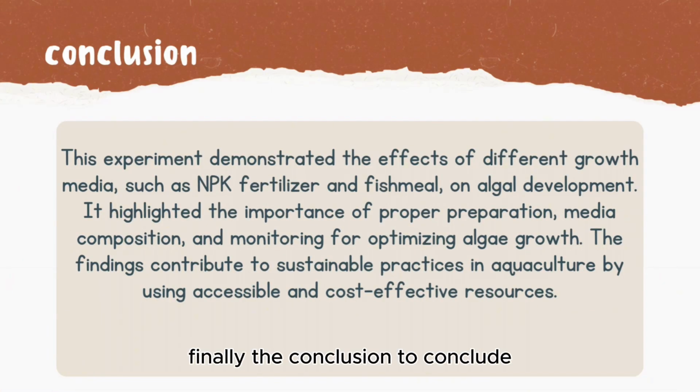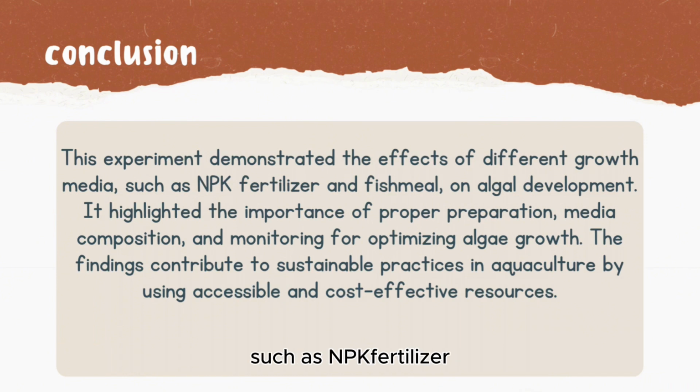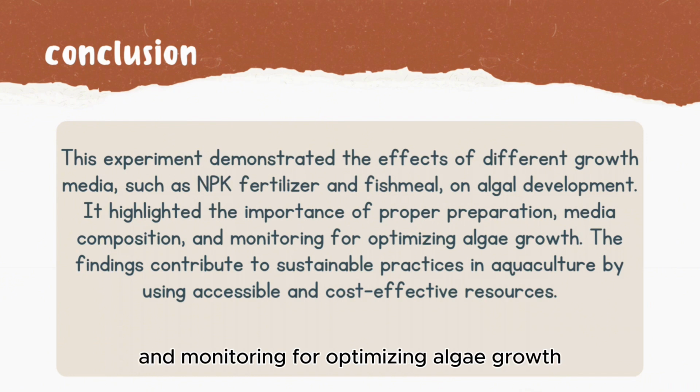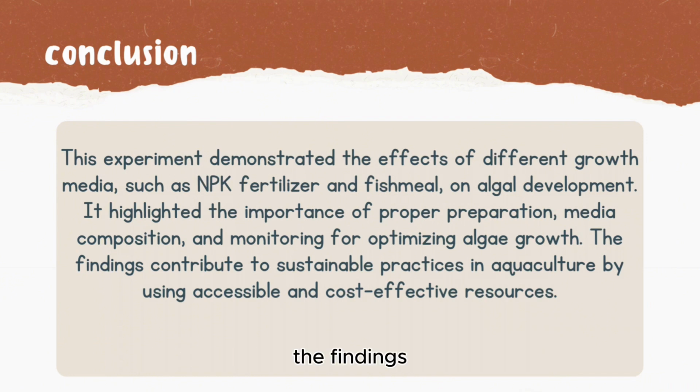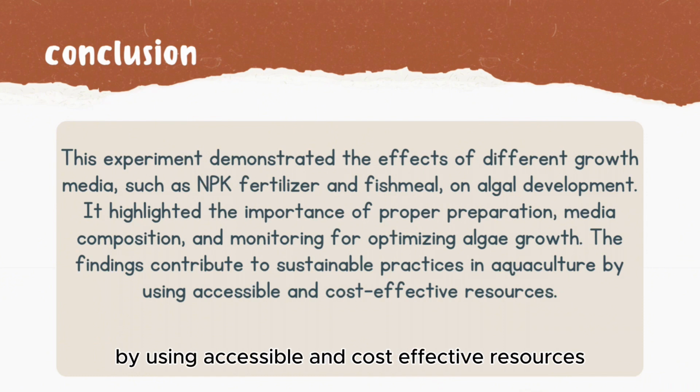Finally, the conclusion. To conclude, this experiment demonstrates the effect of different growth media such as NPK fertilizer and fish meal on algae development. It highlighted the importance of proper preparation, media composition, and monitoring for optimizing algae growth. The findings contribute to sustainable practices in aquaculture by using accessible and cost-effective resources.